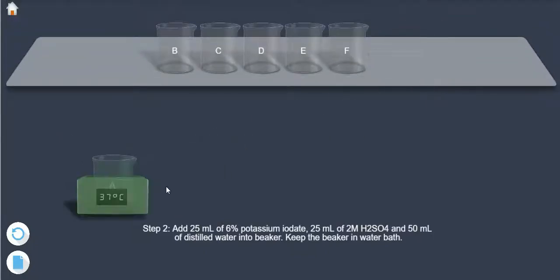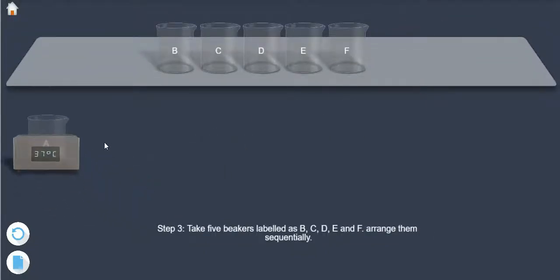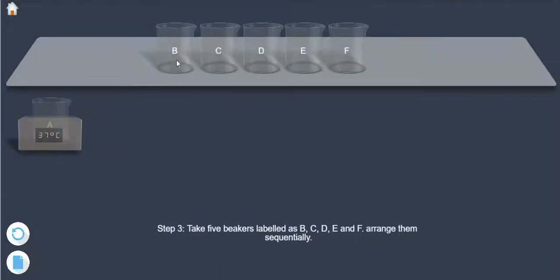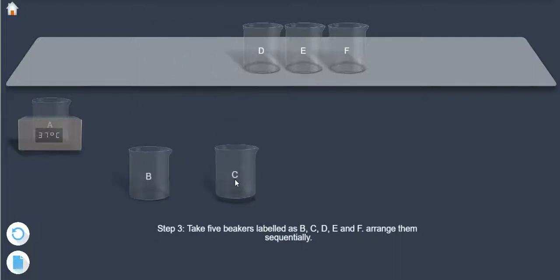Step 3: Take 5 beakers labeled as B, C, D, E, and F. Arrange them sequentially.